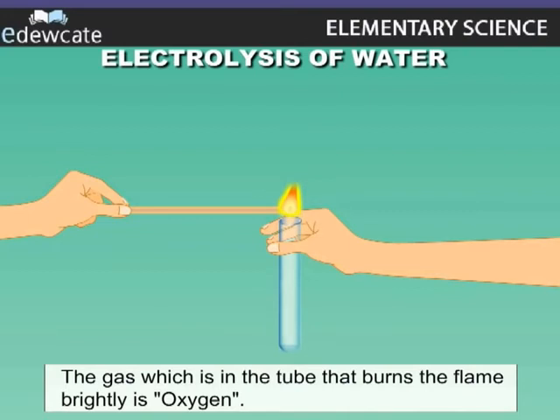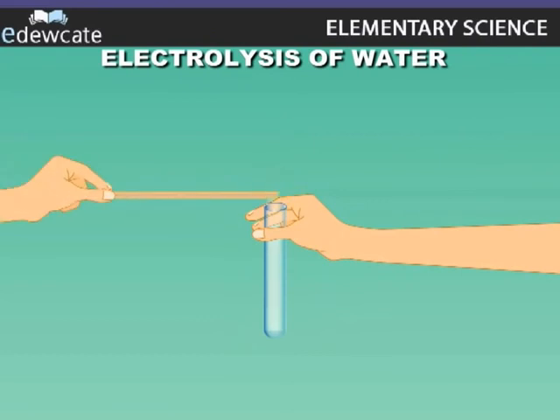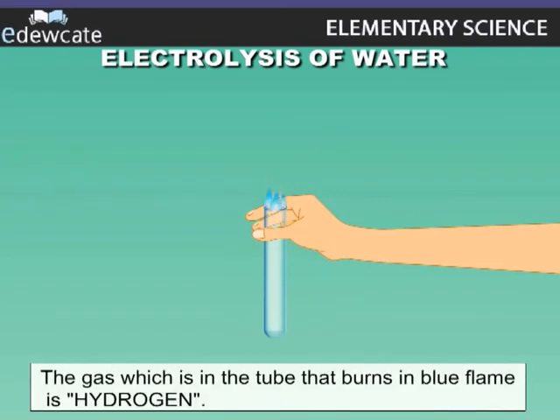Introduce another glowing splinter into the test tube in which more volume of gas is formed and observe it. The splinter is put out with a pop sound, but the gas burns with a blue flame. Hydrogen possesses this property. Therefore, we can say that the gas present in this test tube is hydrogen.